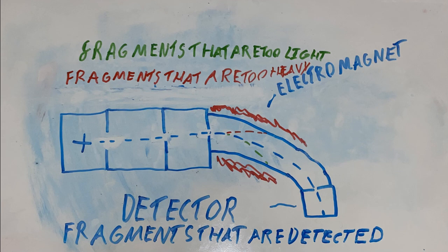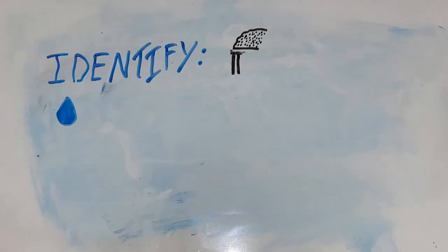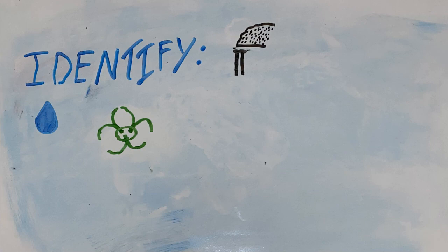But why do we do mass spectrometry? Mass spectrometry is an incredibly useful identification tool. We use mass spec to assist in environmental analysis by identifying the components of polluting gases and determining if water contains chemicals that are unsafe to drink. Scientifically, we can use mass spectrometry to identify and determine the structure of proteins and screen for diseases.